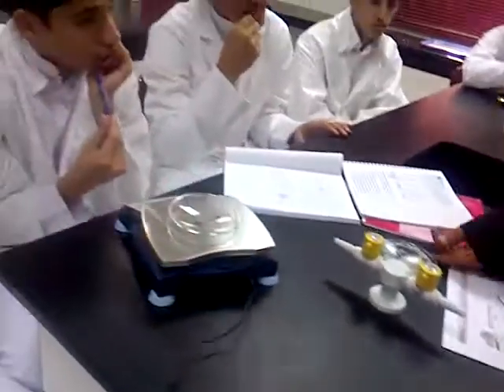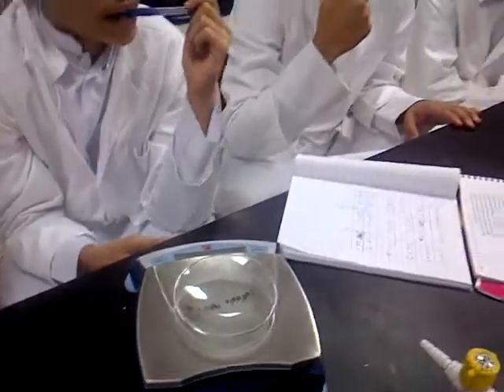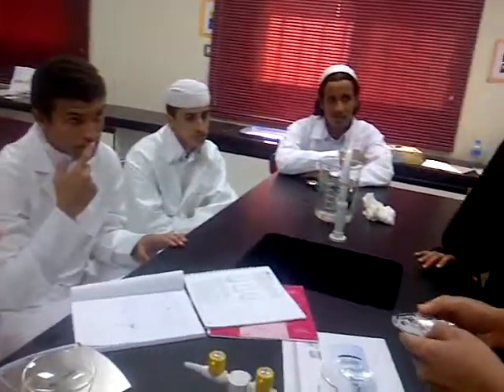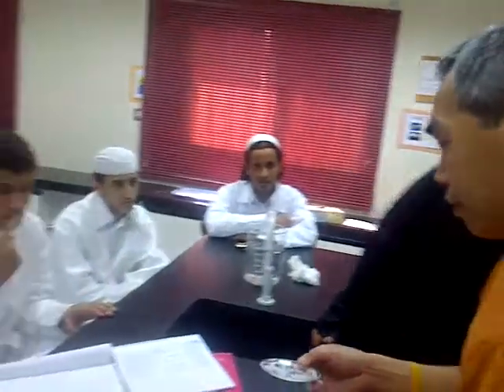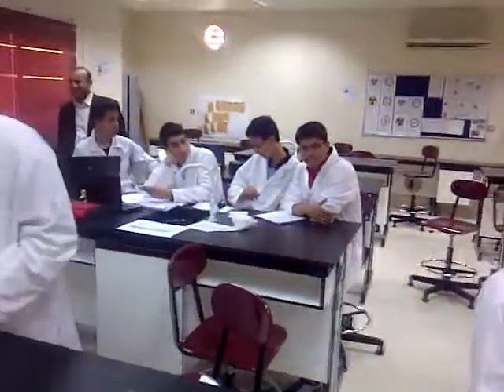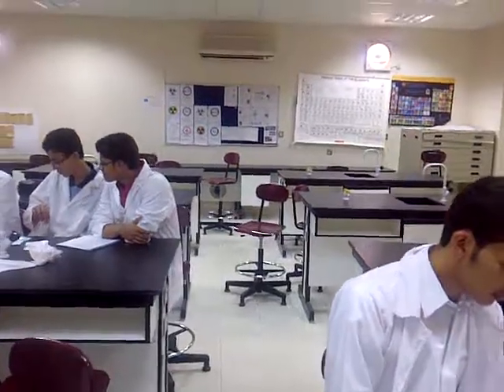They didn't weigh the watch glass before. That's okay. That's how we're trying to estimate. We're going to subtract the glass. Okay, so after they put the polymer, 37. 37 is what? Of the polymer? Okay. So I want to know just the weight of the polymer.